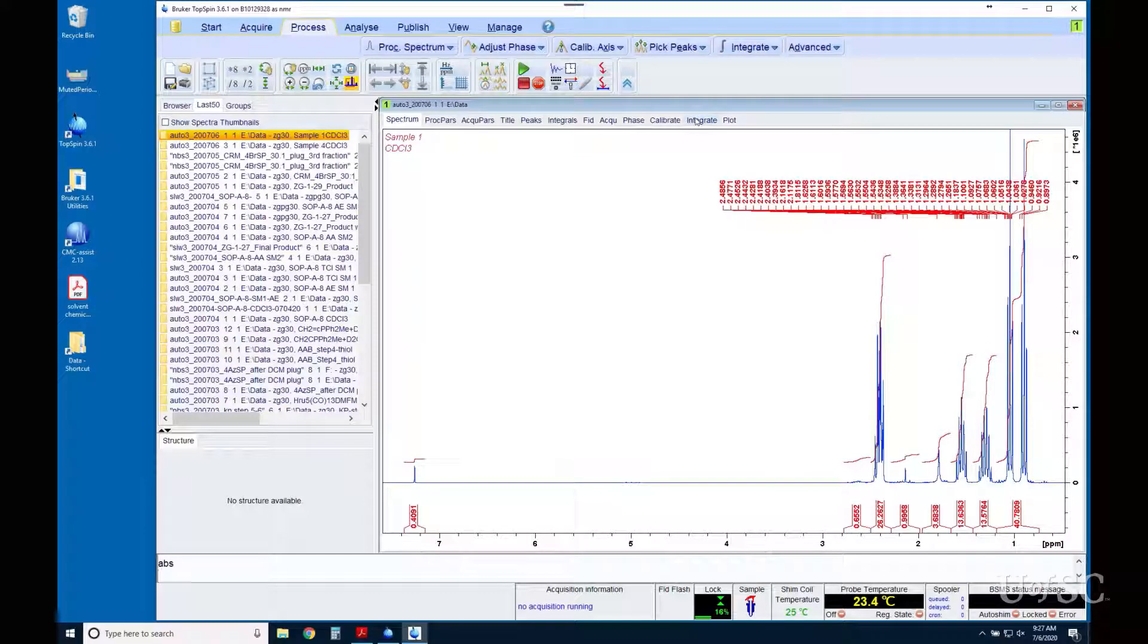If you want to manually edit integrals you should first remove the baseline correction applied during the auto processing by retransforming the FID with the EFP command. The spectrum phase should be checked and corrected if necessary.